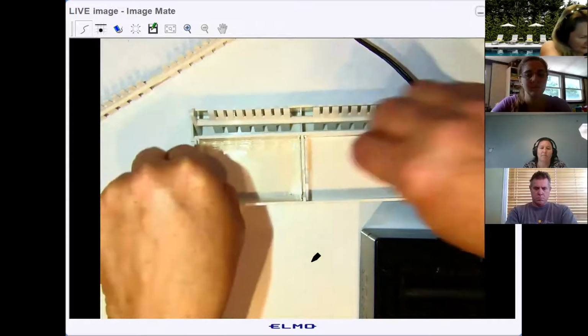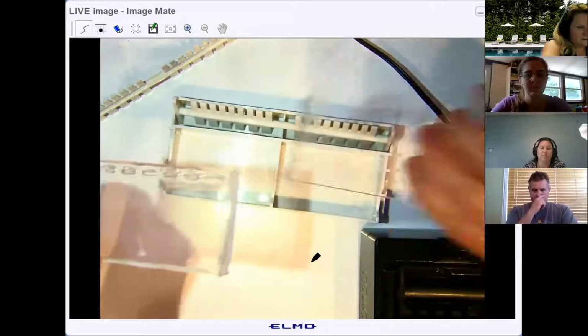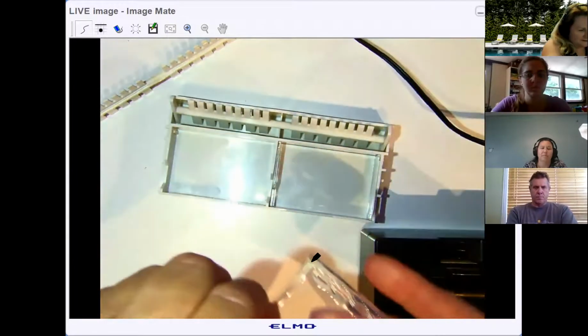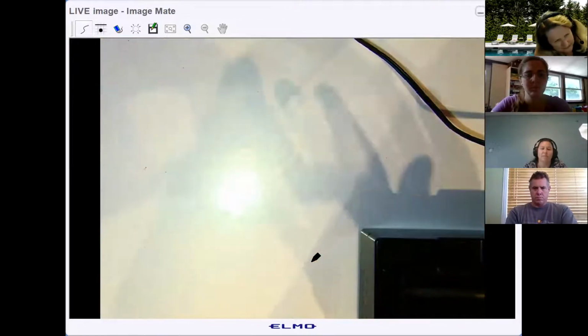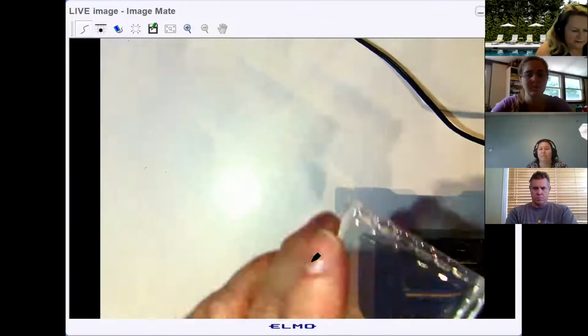Okay. And then you lift this plastic insert. See, here's a plastic insert without the gel. This was in there. So you lift that up. The one and only thing I don't like about this system, and it actually didn't happen today, sometimes the gel overflows a little bit and gets on the bottom of the tray, but that looks like that didn't happen today. So good.